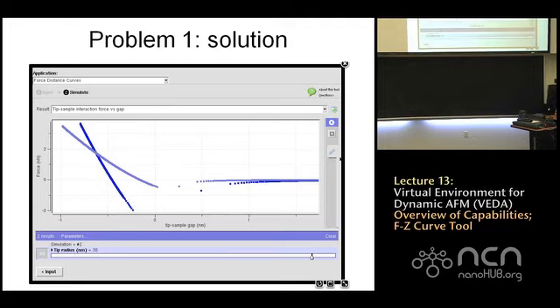One thing I wanted to do was to change the input to specify the intermolecular gap. The default input was adhesion force. Specifying that is basically going to say when the tip gets bigger, the adhesion force goes up because the van der Waals forces are acting on more. So the intermolecular gap is almost more of a material property than the adhesion force.